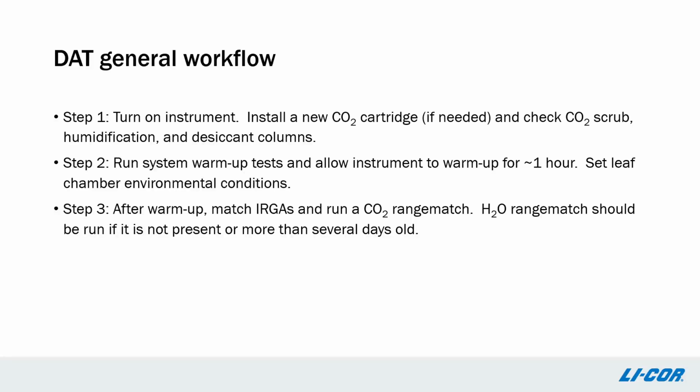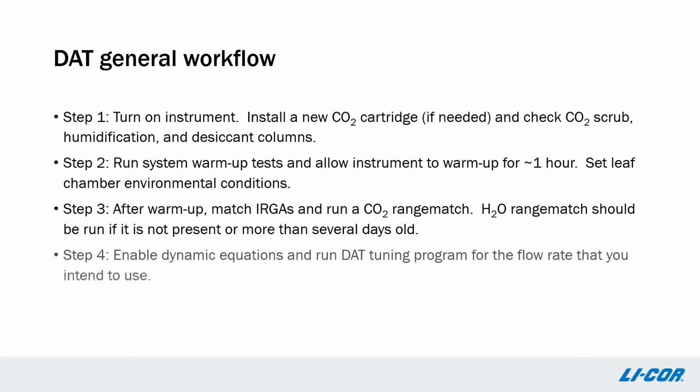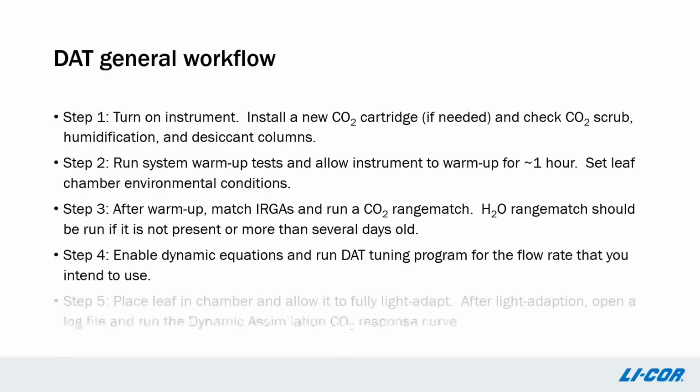Run a water vapor range match if one is not present or if the water vapor range match is more than several days old. Step 4. Make sure the dynamic equations are enabled and run the Dynamic Assimilation Tuning program using the flow rate that you plan to use for your CO2 response curve.